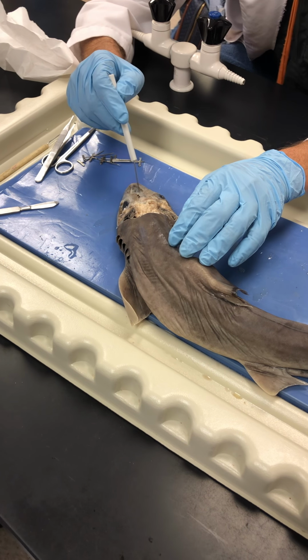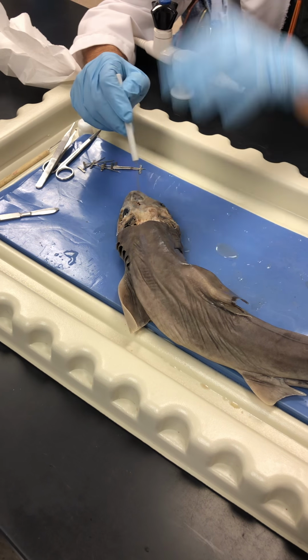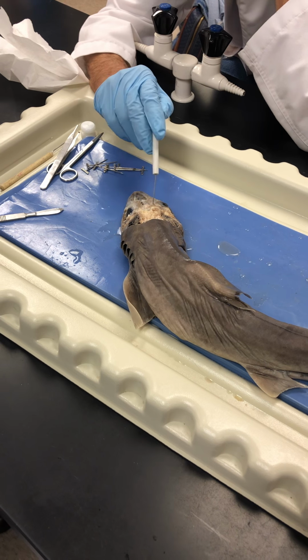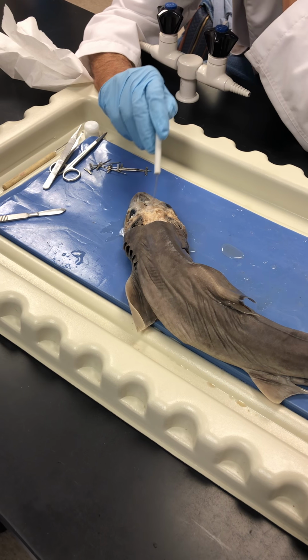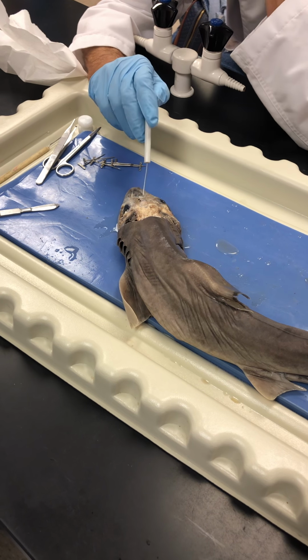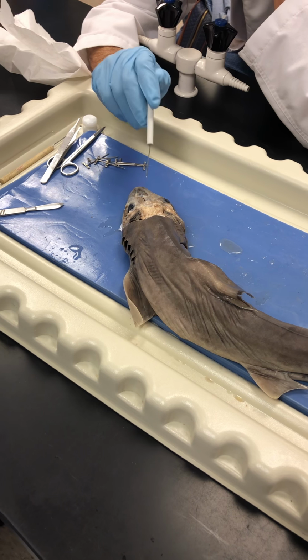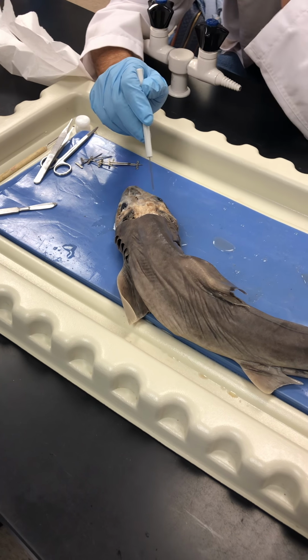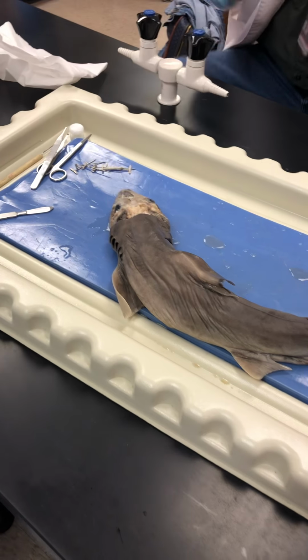Okay, and I really can't see much of that, so you need to show that. You need to show the nerve that comes back up here to the brain. You need to cut this open so we can see all the parts of the brain, and you're going to need to know the names of the parts of the brain and their function. Okay? Have you all cut that part? Yeah. Okay, let's go over here.